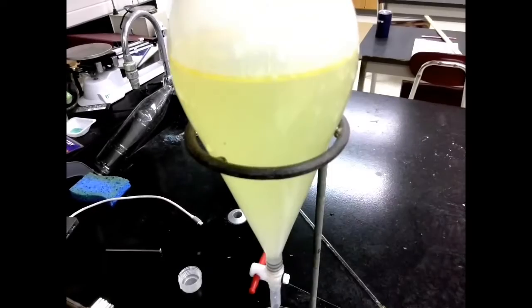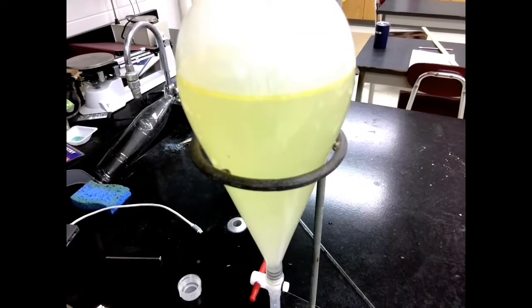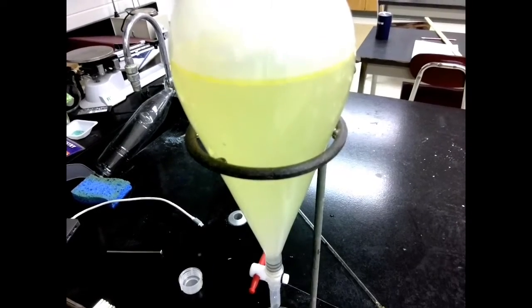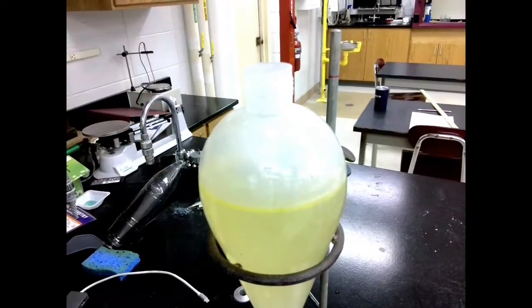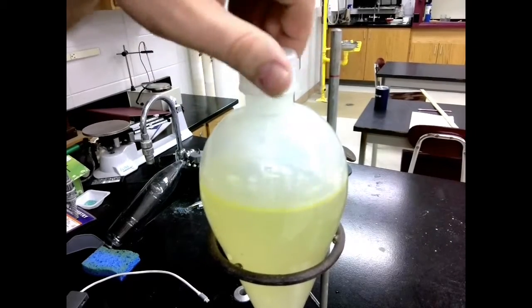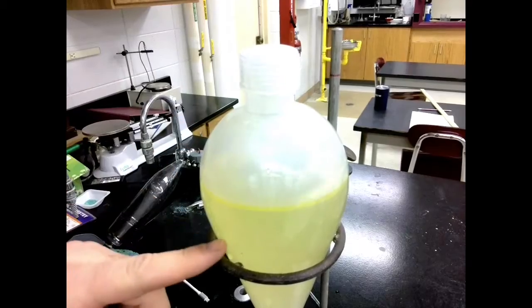Okay? Now that we've given gravity some time to separate our two layers, our water and our oil layer, we're now able to separate the two. Now, notice first, I have the cap taken off of the separatory funnel. If this is on, it will actually create a vacuum in the top here. And by on, I mean screwed all the way on. It can be loose. As long as it's loose, it's good. But if we create a vacuum up here, the fluid won't drain.